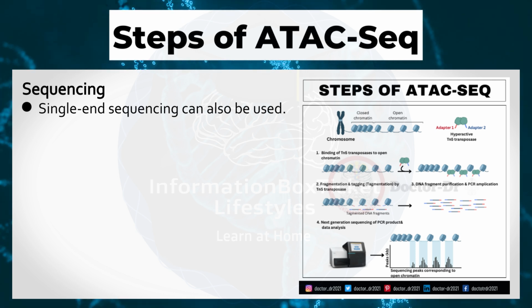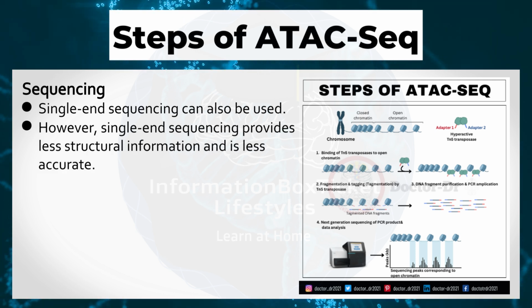Single-end sequencing can also be used. However, single-end sequencing provides less structural information and is less accurate.